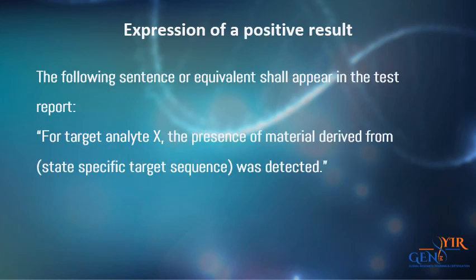Expression of a positive result. The following sentence or equivalent shall appear in the test report. For target analyte X, the presence of material derived from state-specific target sequence was detected. The identity of the GMO may be included, if known.